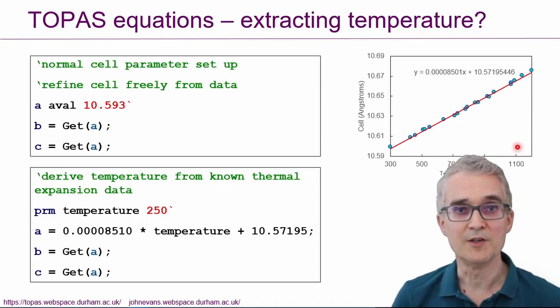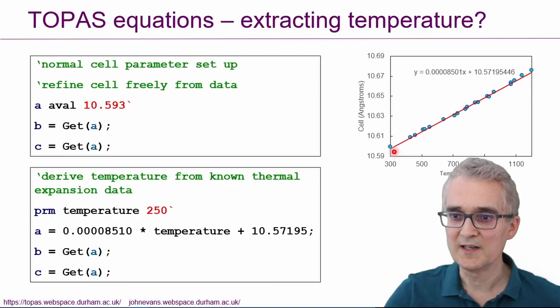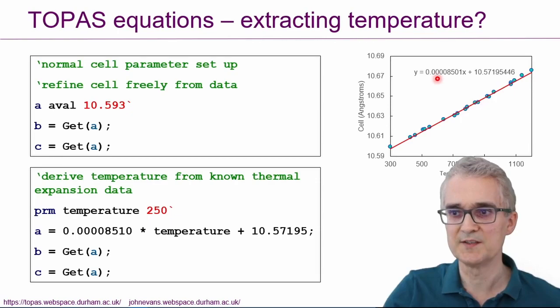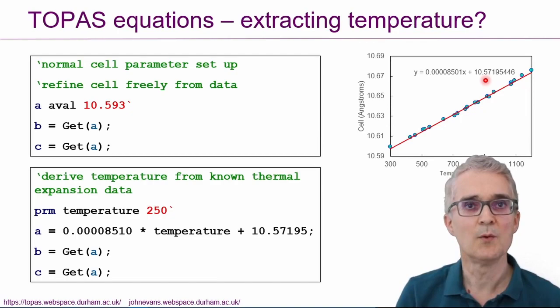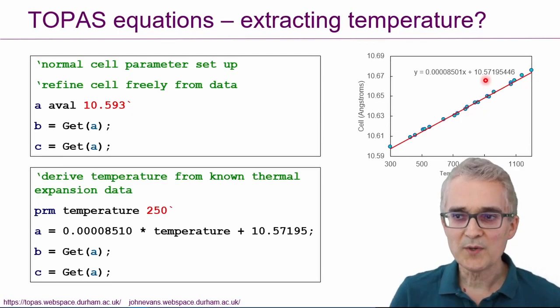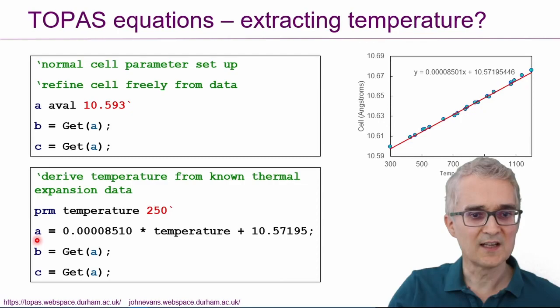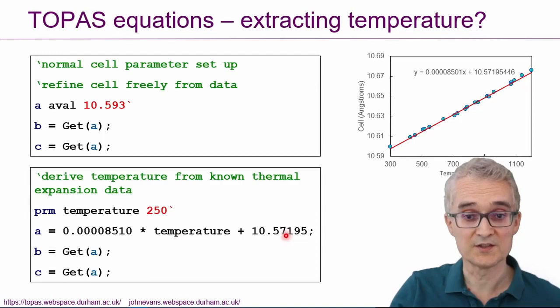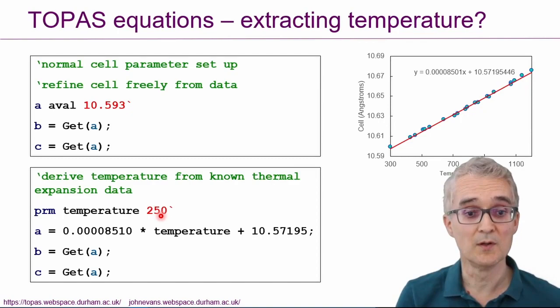In TOPAS, you can actually go a stage further and you can actually set the temperature up so it's a refinable parameter. If we take the data from the literature and over a small temperature range, we can approximate the thermal expansion by a simple linear equation. Here's the equation on the screen here. The cell parameter is something times the temperature plus a constant. Now in reality, over a wider temperature range, we have to use a slightly more complicated function, but this is good enough for this video. And then what we can actually say in TOPAS is we could define this parameter called the temperature. And we can say that the cell parameter should be given by something times temperature plus the constant. And if things are set up correctly, the temperature becomes a Rietveld refinable quantity.